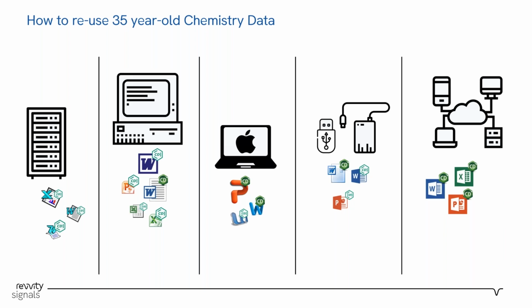But what happens to all of that content as you start to move on, as the years pile up, and you've got all this content sitting in different places? The ideal state is, hey, we can always still go back to it. We still have a record of it. We can use it. The reality of this situation is not quite so rosy. Realistically, most of that stuff just turns into a graveyard, right?